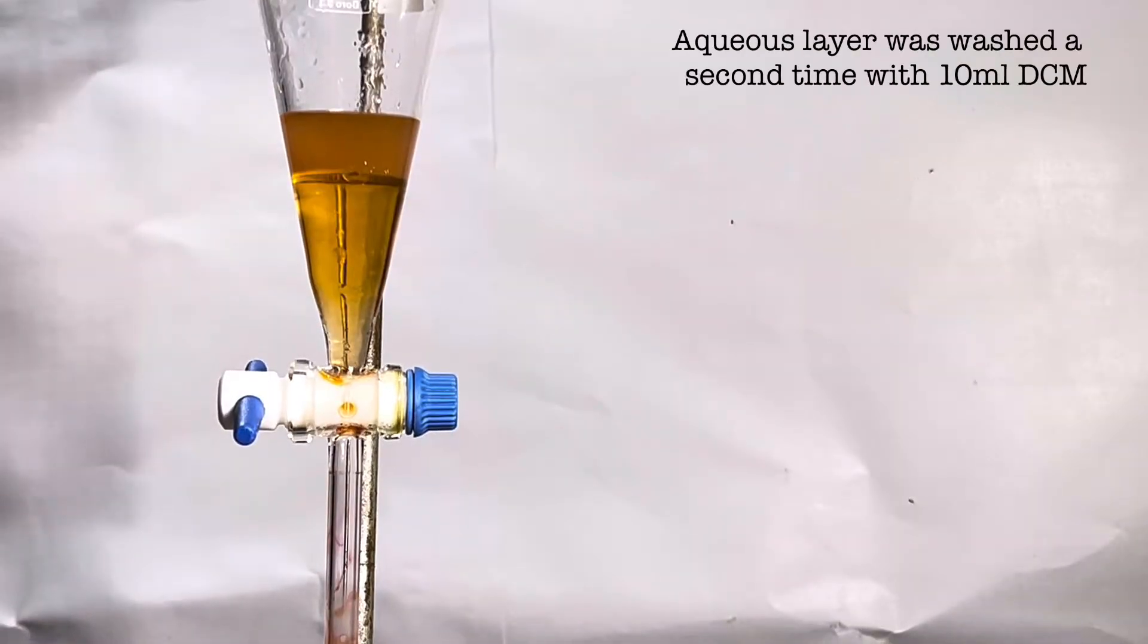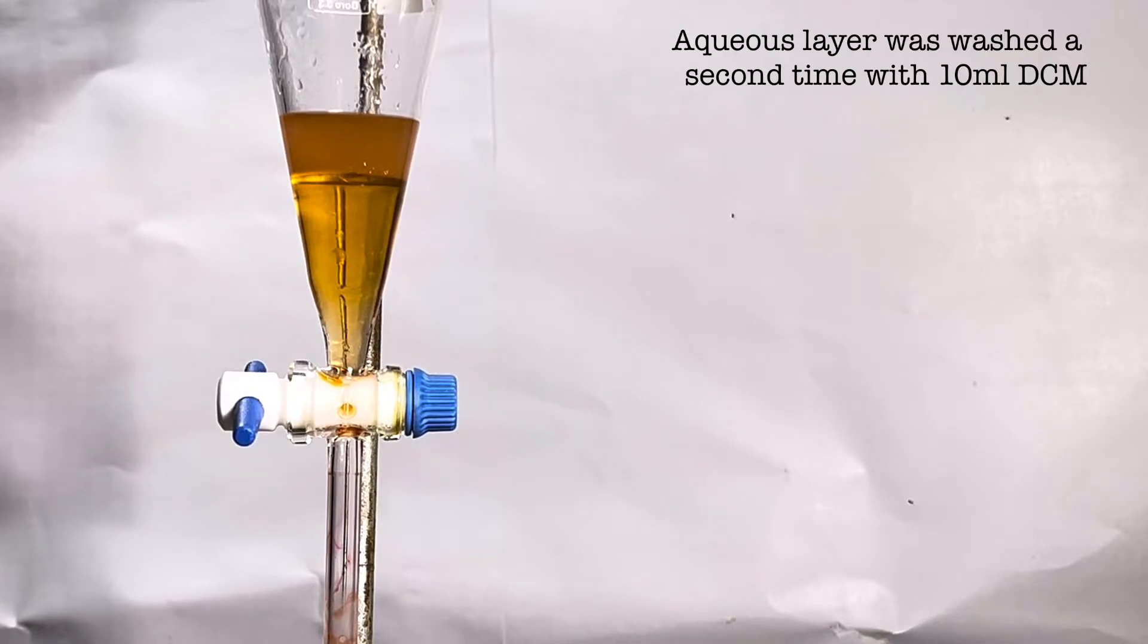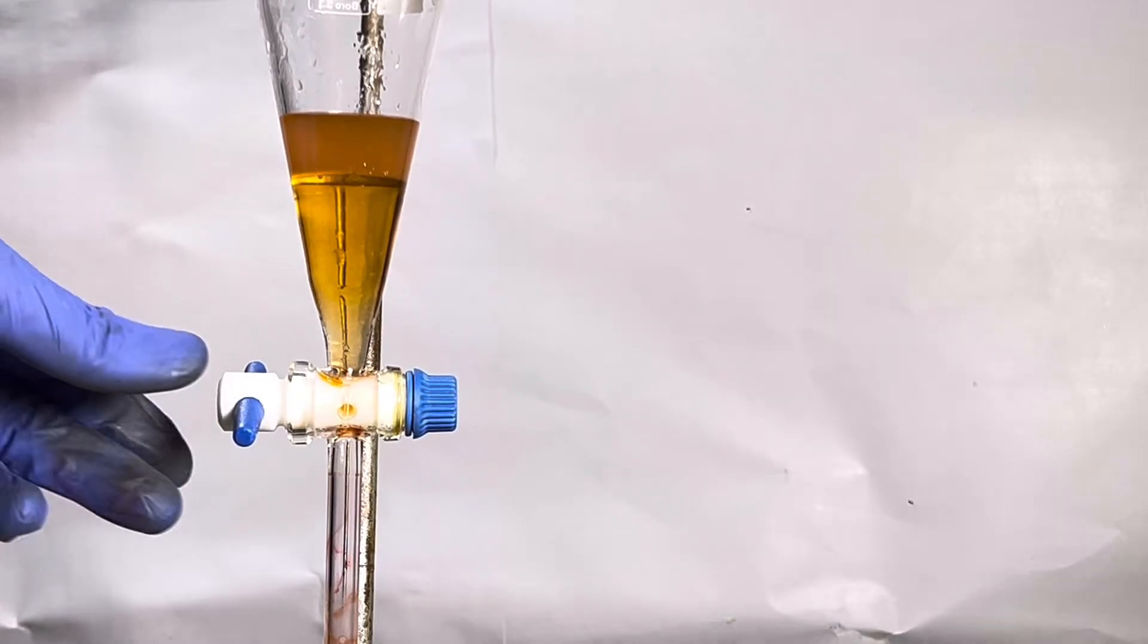Before discarding the upper aqueous layer, it was washed again with 10 ml of dichloromethane to extract out any remaining phenolphthalein. The color of the dichloromethane layer is not as dark compared to the previous extract indicating less phenolphthalein in this extract. The dichloromethane layer was drained into the previous organic layer.